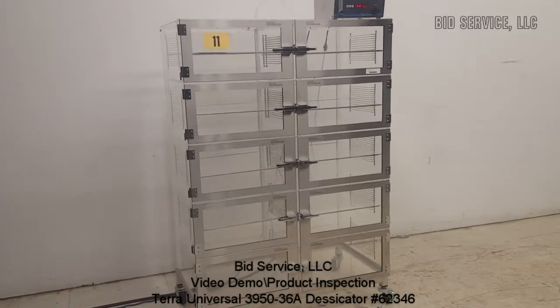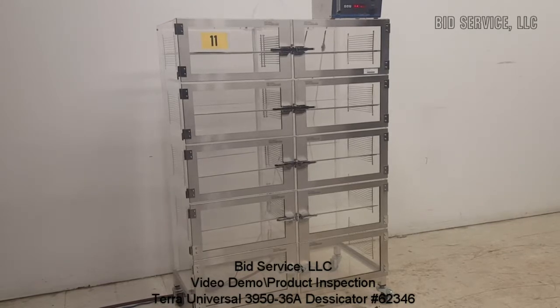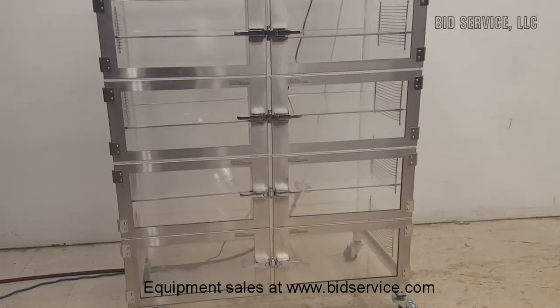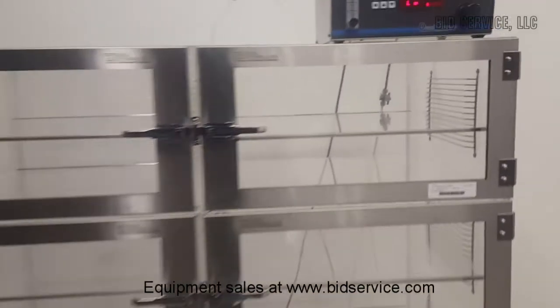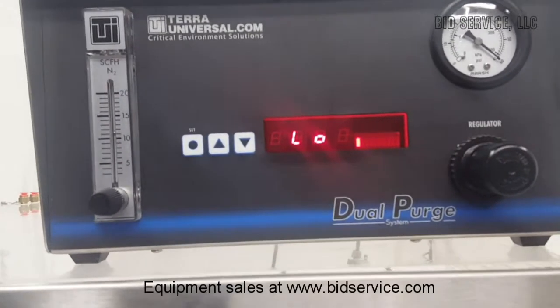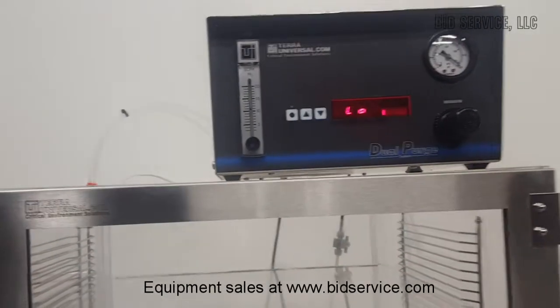This is the Terra Universal 3950-36A desiccator. It has a dual purge controller. Right now it's on low purge.